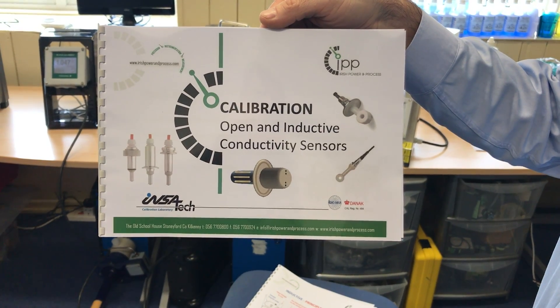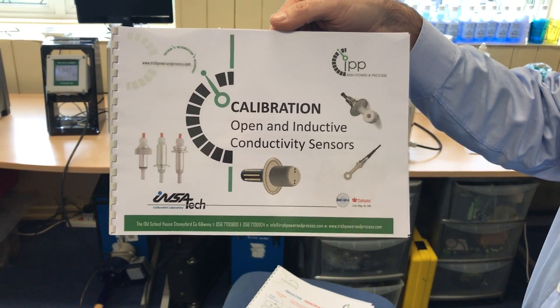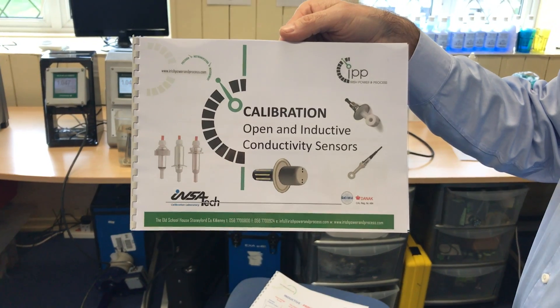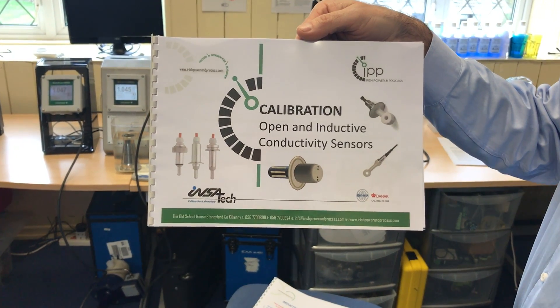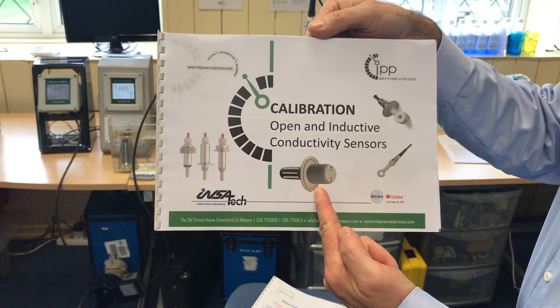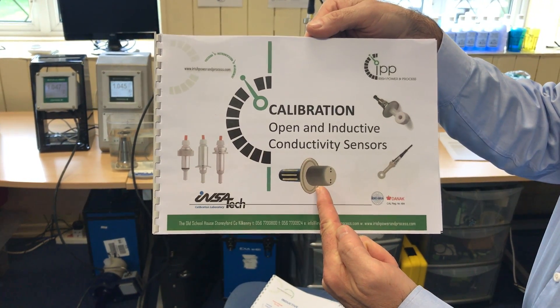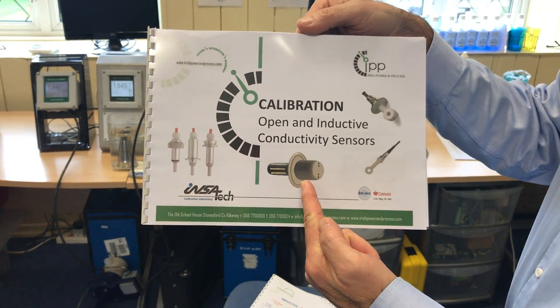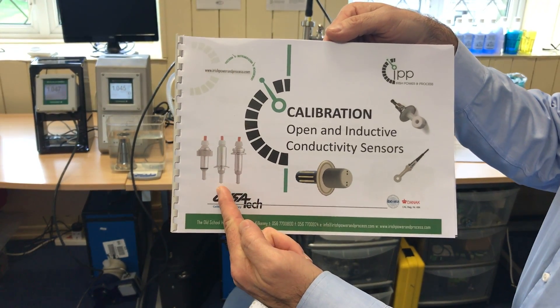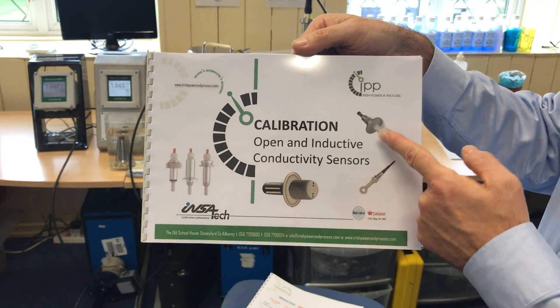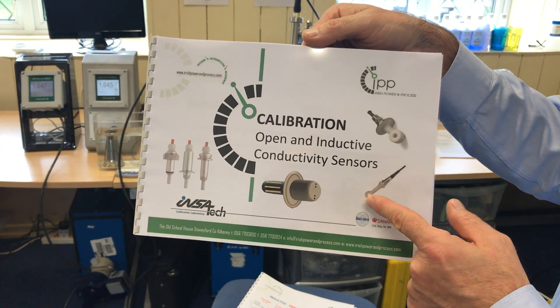Today we're going to look at the calibration of open and inductive conductivity sensors that are used quite widely in the pharmaceutical industry. This sensor here is particularly widespread for CIP skids, chemical makeup — this type of Hamilton sensor and the inductive round design sensors.